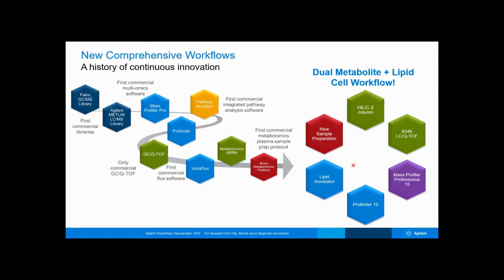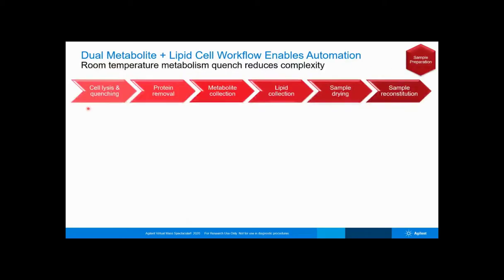The first portion of this webinar will focus on the new dual metabolite plus lipid sample prep workflow. One of our main goals for development of a dual metabolite plus lipid workflow for cell sample omics analyses was to make a workflow that could be automated. However, there are a few steps in the typical cell sample prep workflow that are difficult to automate.